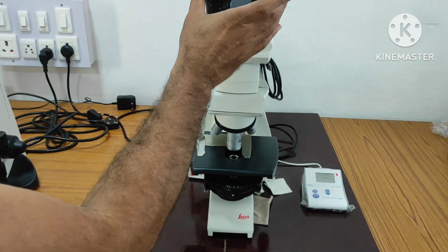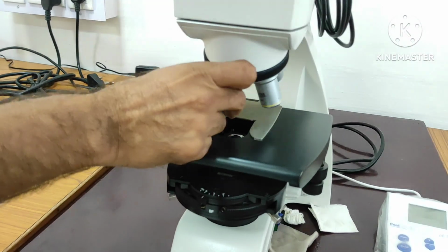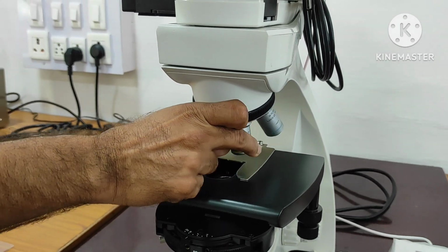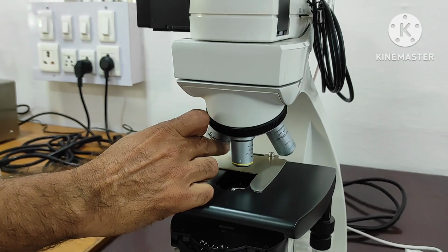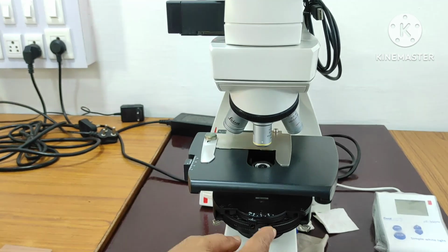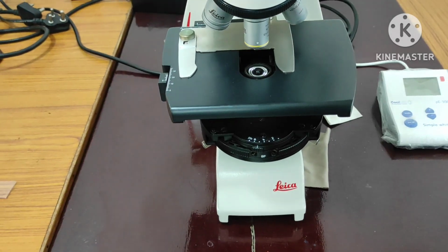These are eyepieces. Then this is the revolving objective nose, right. We start with the lower power first, then higher power, and finally this is having 100x, right. When most of the things are with better clarity and magnification, with high resolution we can observe. And based on our requirement we can adjust here also, right. Various kinds of filters are present because of phase contrast, right.